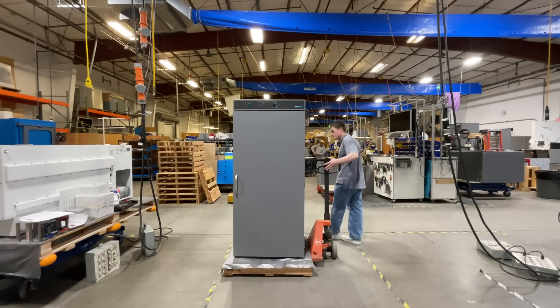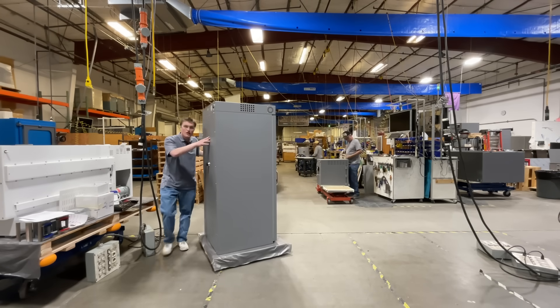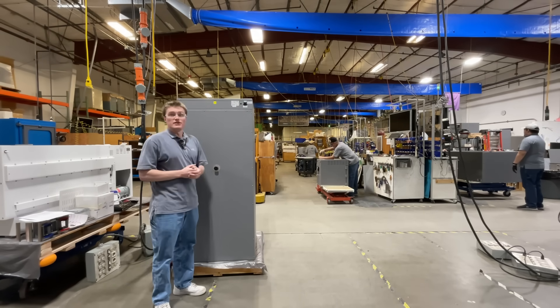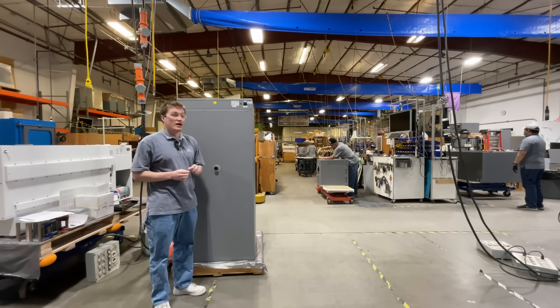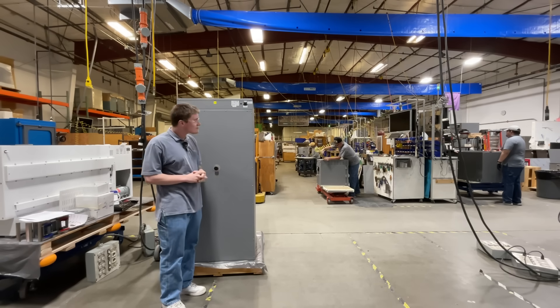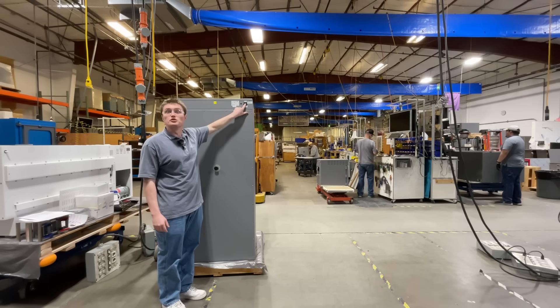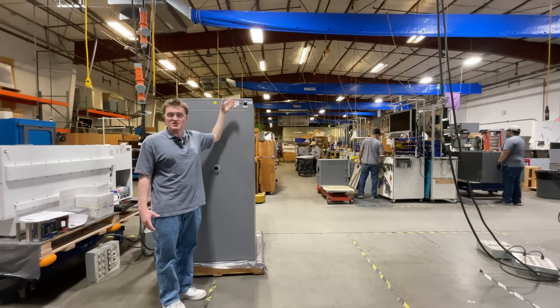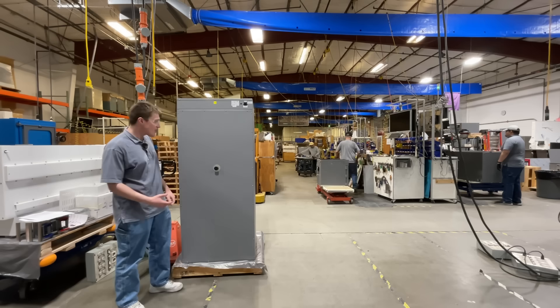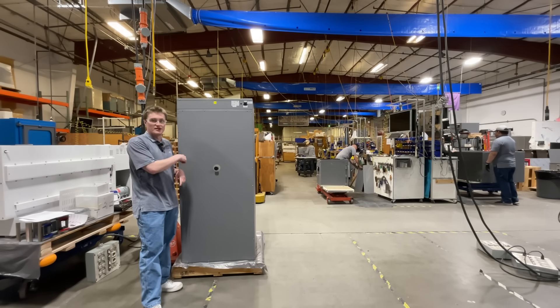Let's take a look at the rear of the unit. Located on the back, you will find the electrical inlet in the upper right corner. Each unit is provided with a properly rated power cord that must be connected to a properly grounded electrical outlet. These inlets are provided with a detachable fuse drawer that is easily accessible from the outside, should the user need to replace any fuses during operation. Additionally, you will find the other end of the 1¾ inch access port that we talked about on the inside of the unit.